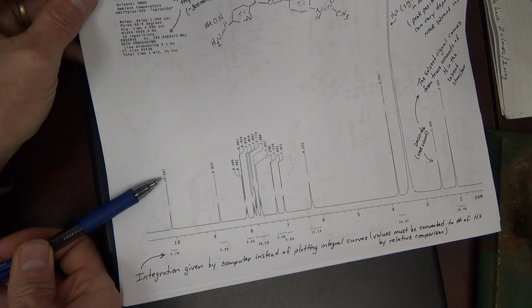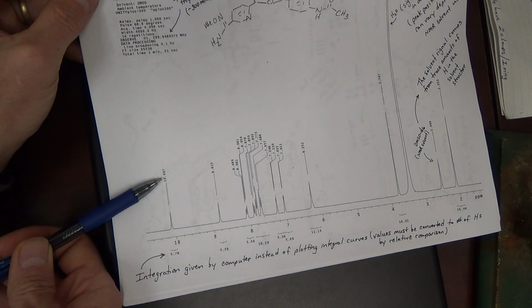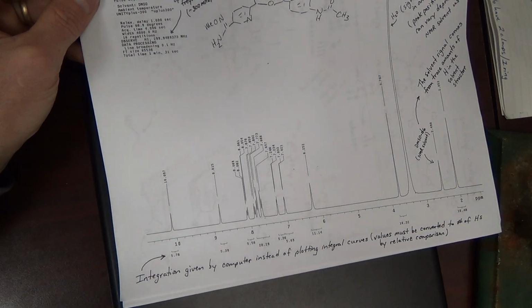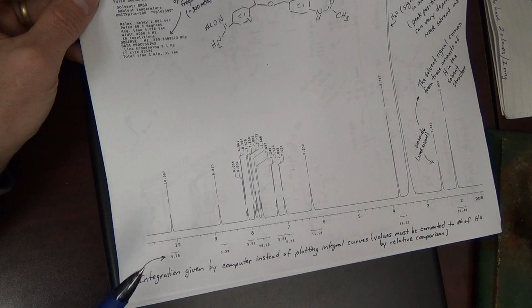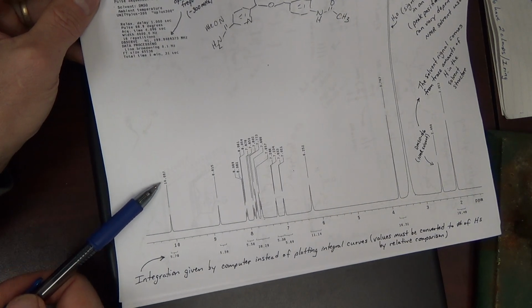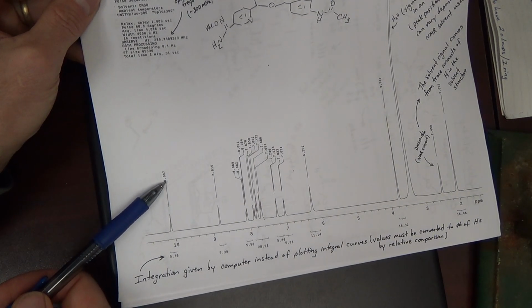All right. And by the way, in NMR, usually you just stick to 2 decimal places, at least for proton NMR, 2 decimal places. In carbon NMR, it's standard to go with just 1 decimal place. So 10.09, or we could round this off to 10.10. Basically, this is your exact ppm.